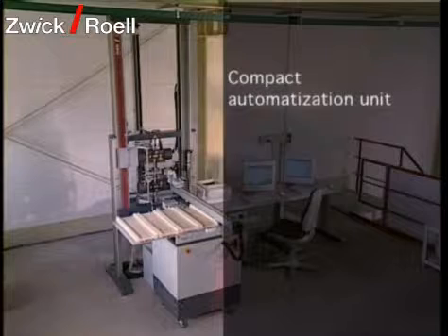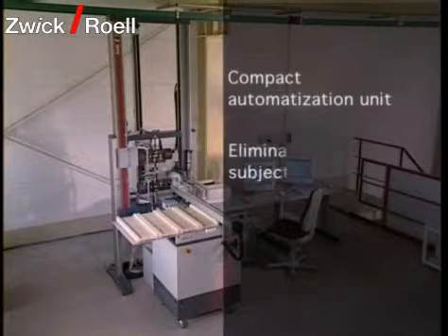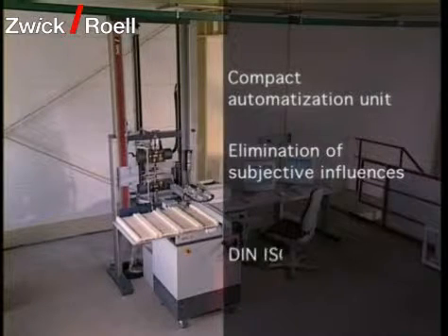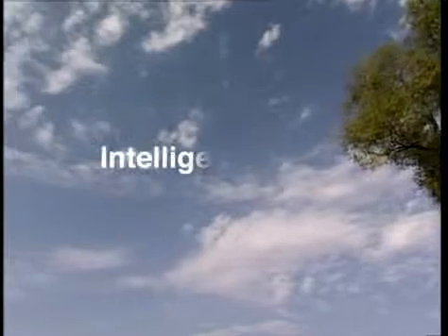Because of the compact construction of the automatization unit, only a small area is required for placement. Subjective influences are eliminated by the high positioning accuracy of the automatic specimen feeder. The traceability of test conditions to DIN ISO 9001 is ensured.